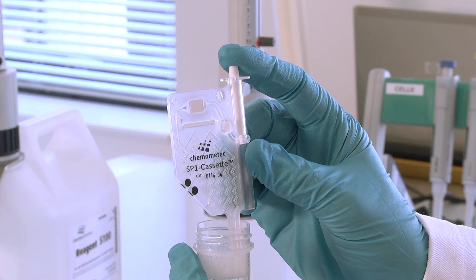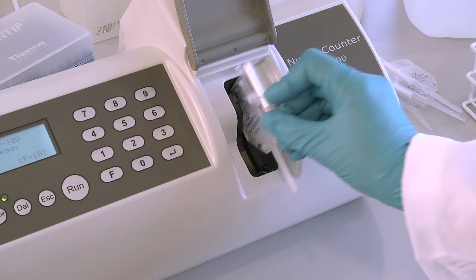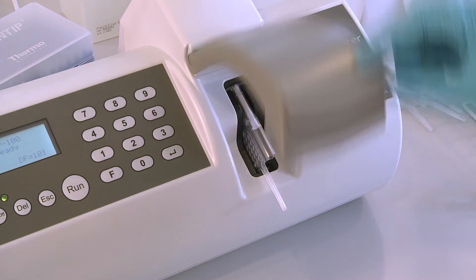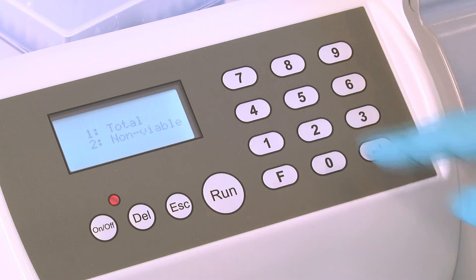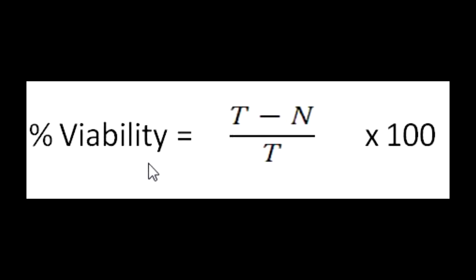Load a new cassette with a sample diluted with PBS instead of reagent S100. Insert the cassette for the non-viable cell count, press RUN and press 2. In a minute, the instrument shows the non-viable cell count in the display. Now the percent viability can be calculated. The SemenVue software does this automatically.